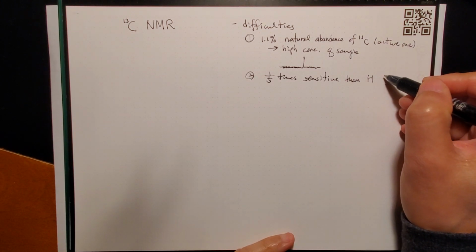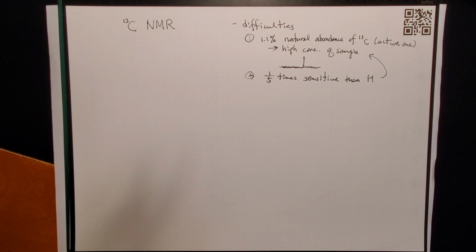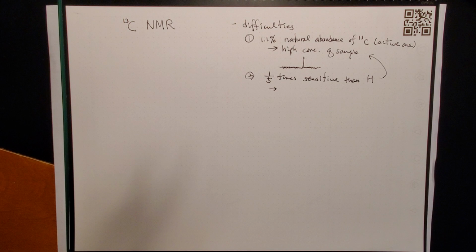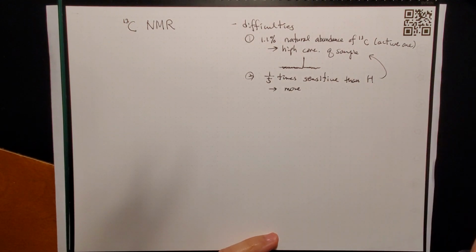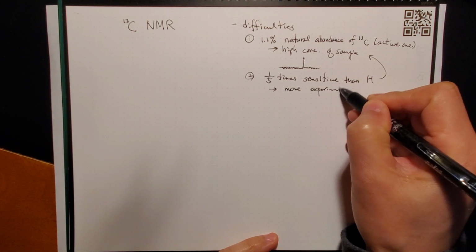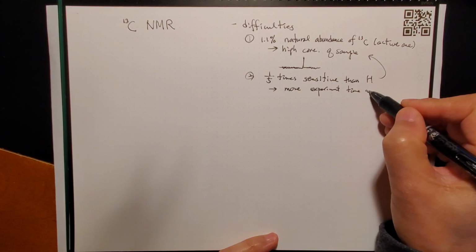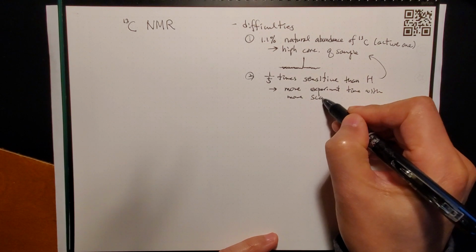Therefore, you also need a higher concentration. Additionally, you may have to run the experiment for a longer time with more scans.